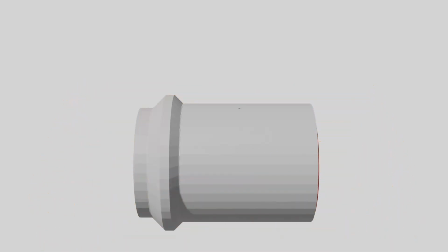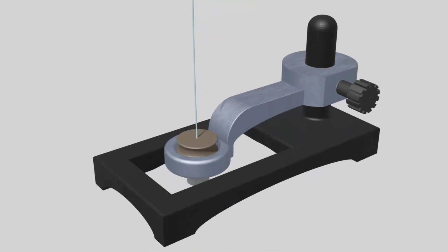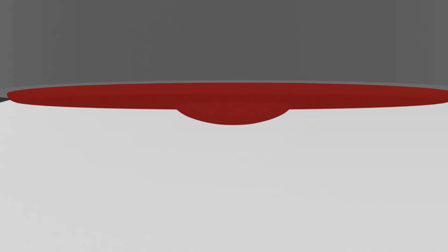After the cells are stained, we then place the tube into the device stand situated on top of a confocal microscope for radial view. An additional microscope is used to capture a side view. A force is applied to the cells using a syringe pump and microfluidic tubing. This force is applied until the material fails, meaning until the cell monolayer breaks.